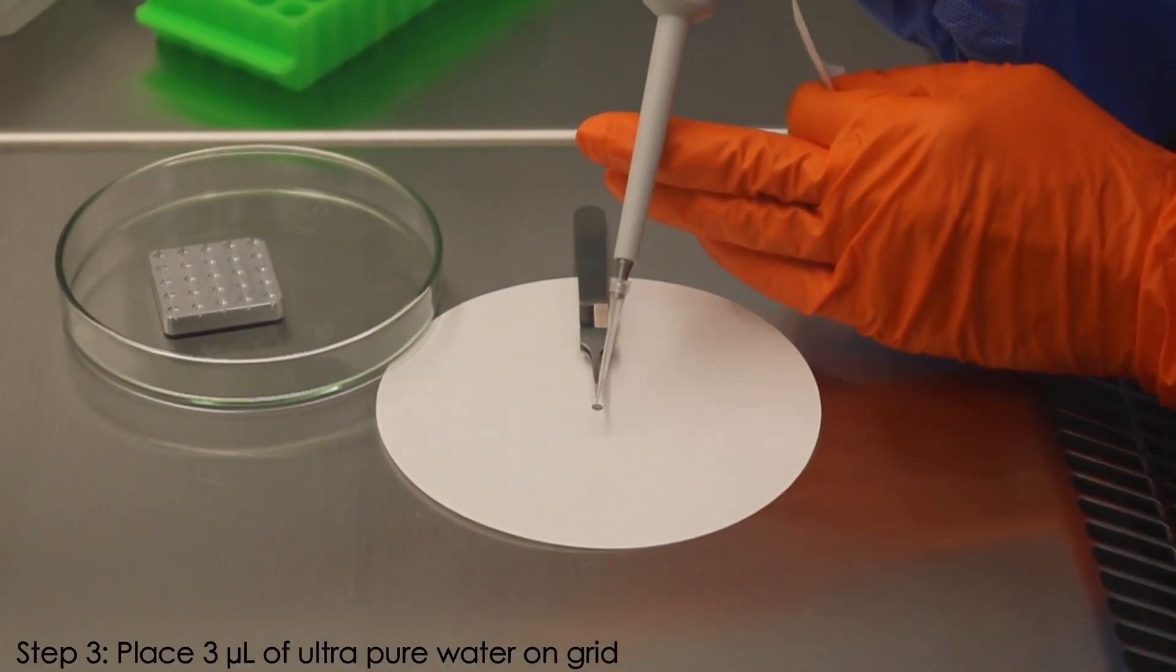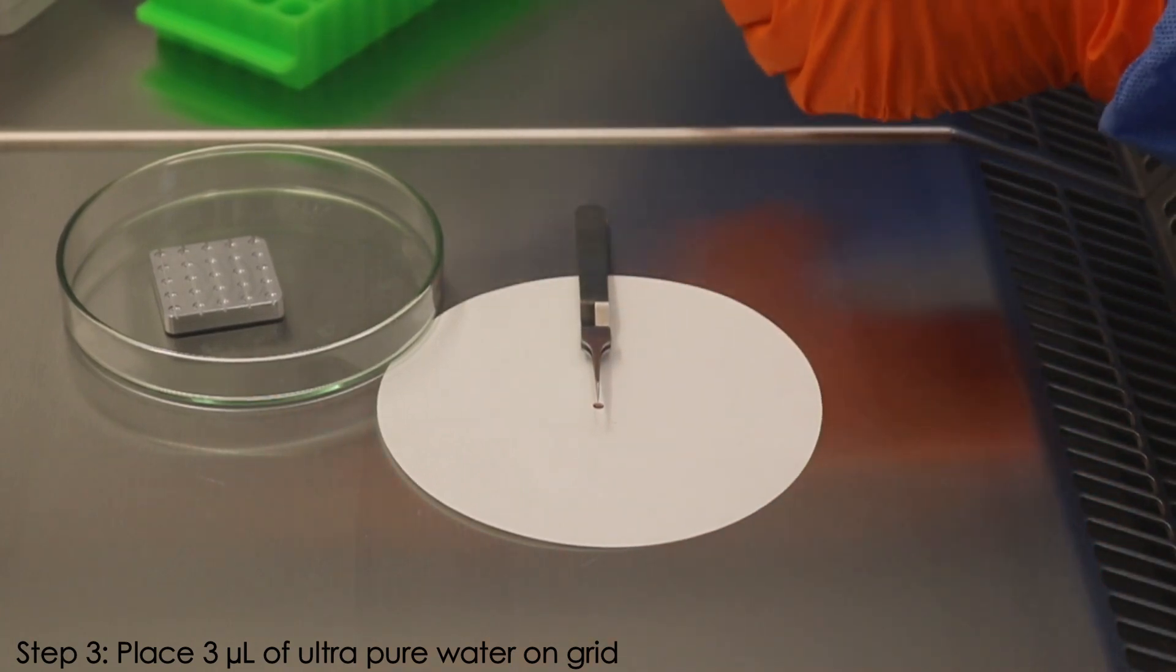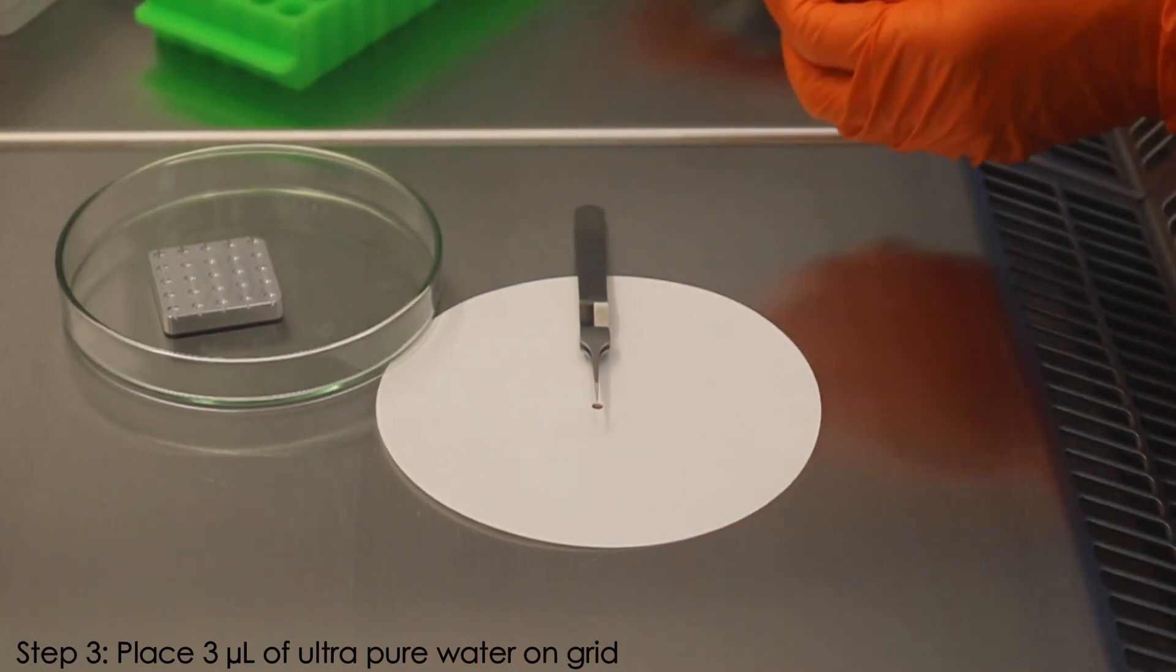Immediately after blotting, place 3 microliters of ultra-pure water on the grid and prepare a pipette with 3 microliters of stain.